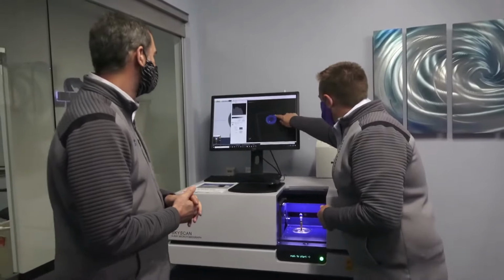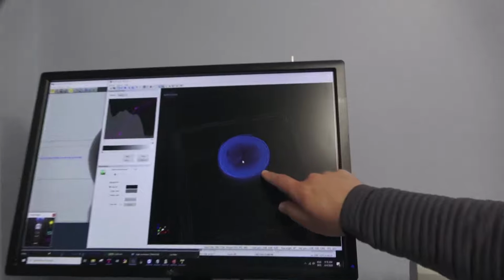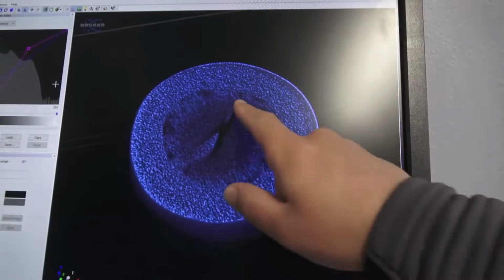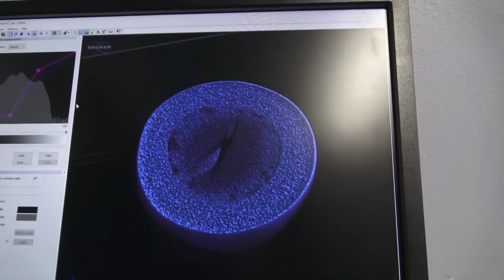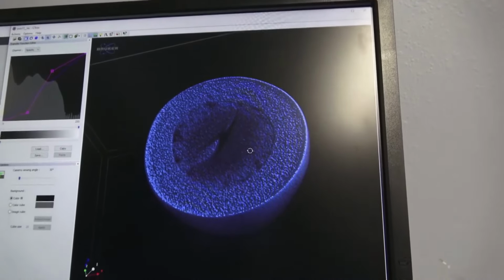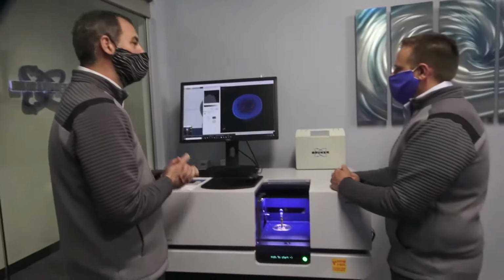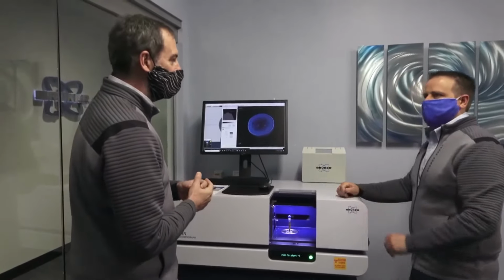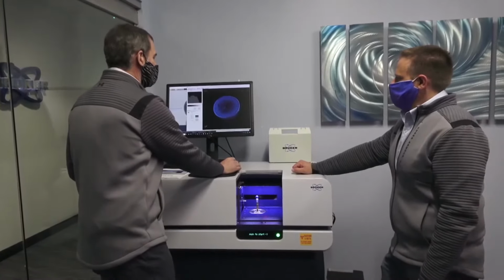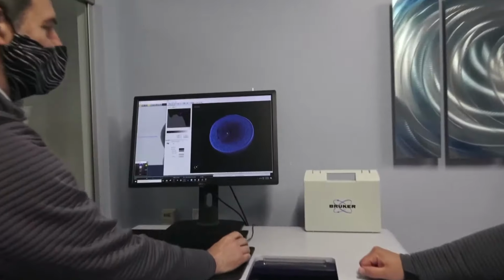So yeah, I can definitely see here on the edge there, it looks like a shell. Yep. And then we have a little area here with some little pores in it, maybe. And then that looks to be what, the peanut? That is the peanut. With a little crack going right in the middle. So there we can see both the presence and the absence, and what's that contrast coming from? The contrast is coming from chemical differences. So, like I said, X-ray microscopy is sensitive to the atomic number of the material and the density. So, granted, a lot of this is carbon-based, but we're seeing this is a more dense material than this. Yep. Right, and then this is even a lighter material.